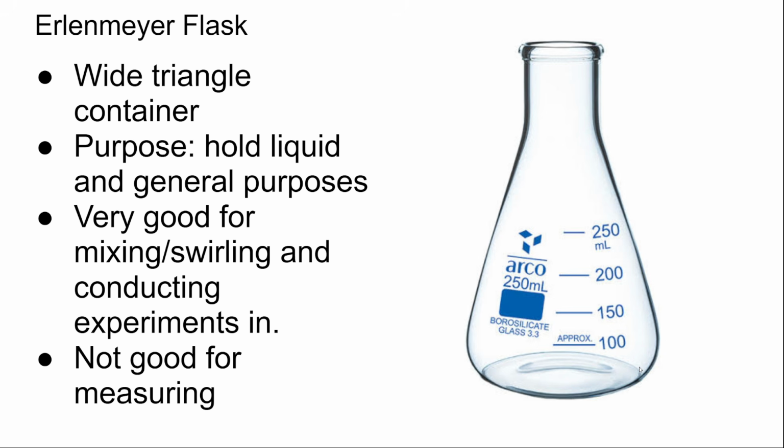We use this quite often in this class whenever we have to mix multiple things together without using something like a stirring rod to stir it around with.